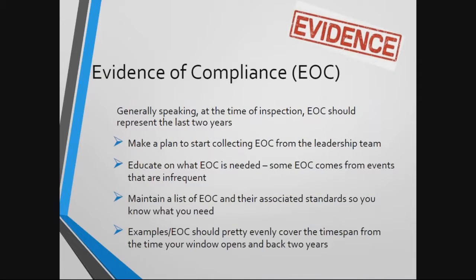While inspection teams might have their own list of examples they would like to see, having your evidence of compliance ready at the time of your inspection lends to a smoother and more effective inspection. This eliminates the need to rush around trying to find an example of something when there is such a limited amount of time and so many things to do during an inspection. Knowing what evidence of compliance is needed is important, as some activities do not happen every day. Maintaining a list of what evidence of compliance is needed and then sharing with the leadership team so that they know what they need to look for is good practice.